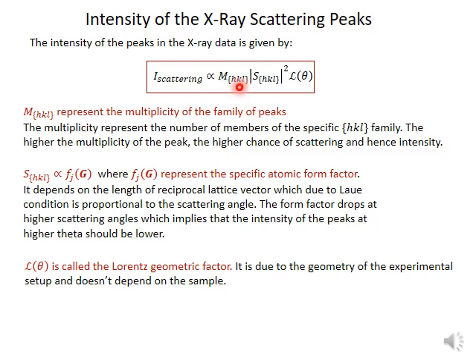It only has how much multiplicity a specific HKL combination has. This is definitely, for X-ray diffraction, angle dependent. So this tells you that at higher theta the intensity should drop. This factor again tells you that the intensity should drop as you go towards 120 degrees, but it would rise sharply at 180 degrees again.